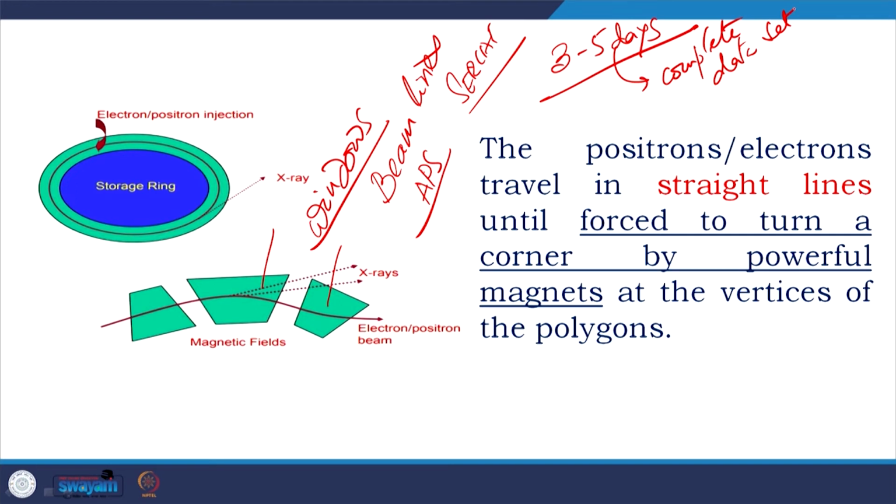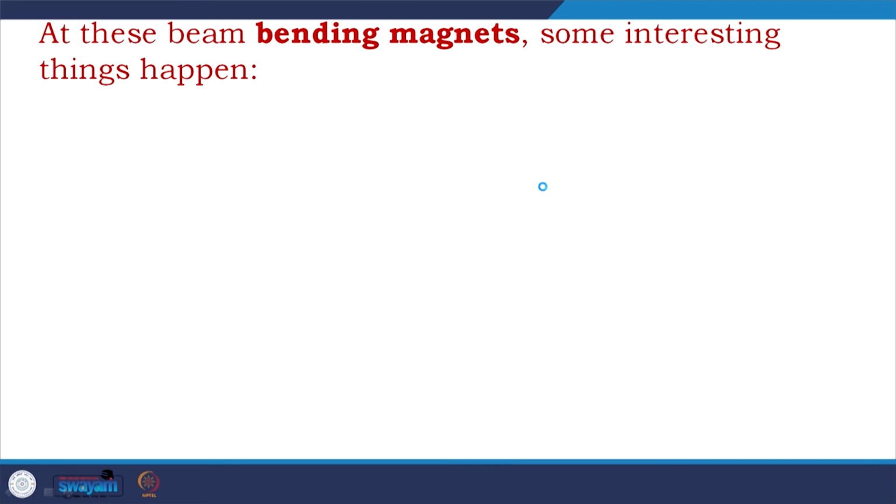In comparison, a synchrotron takes 20 seconds for one frame, which means around 20 minutes for the entire data. For home sources, it used to take 10 to 30 minutes for a frame. That was the difference. Fortunately, the difference is also getting reduced day by day.